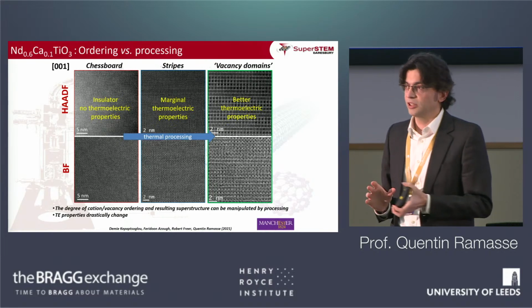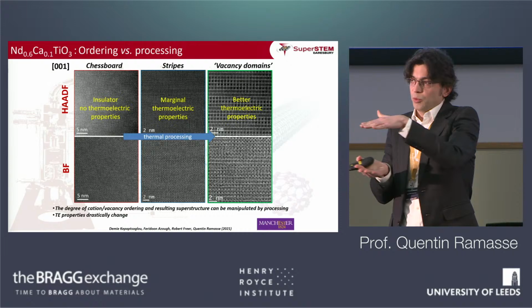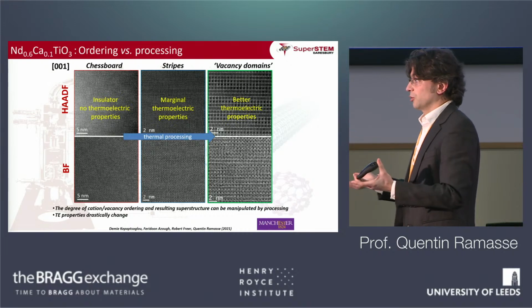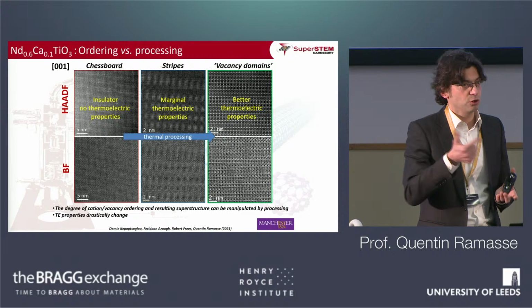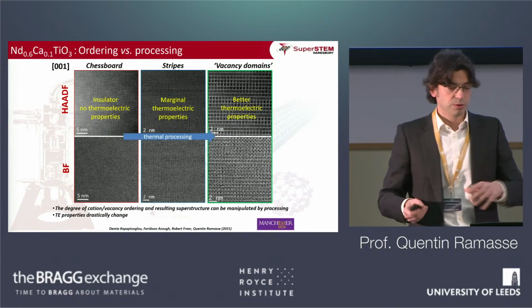But that's not very quantitative, and also because you're still looking through a material that is perhaps 10 or 20 nanometers thick, it's a projection. That's the problem with microscopy. You're looking at projection images unless you have a single layer of atoms. So you need a way to combine all this information together and to relate what you see to the property.